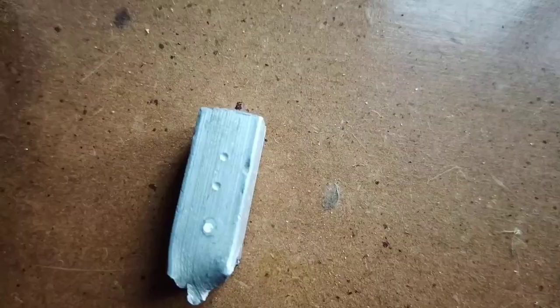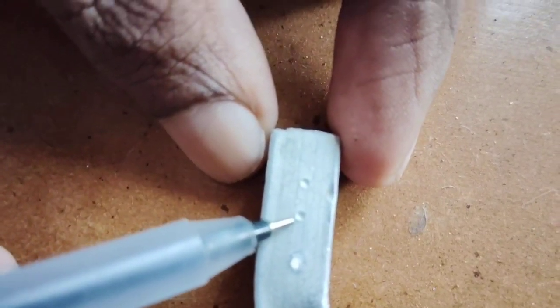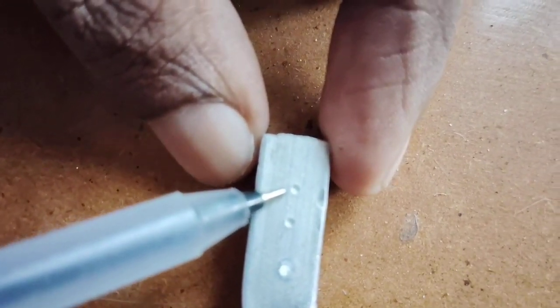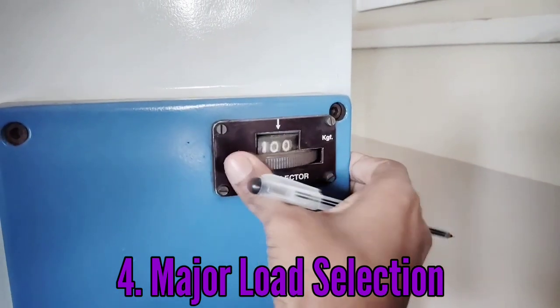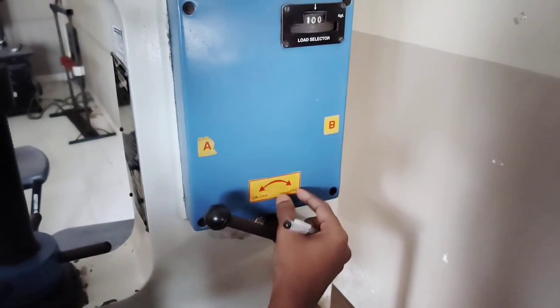Now, if you come closer and see this, I have performed this test earlier. As you can see, these are the indenter holes, or marks, you can see on the test specimen. After performing the experiment, you can see such kind of indentation over the material. After that, as we know, according to the scale, we will apply a load of 100 kgf. Now this is an unloading and loading system.